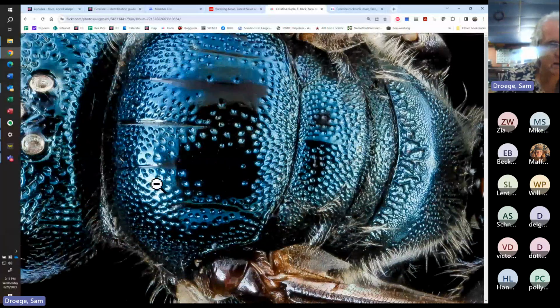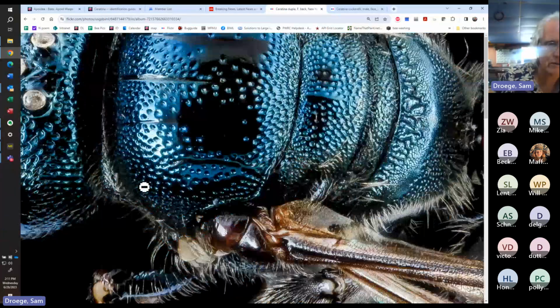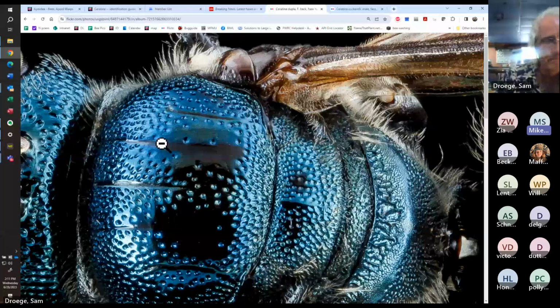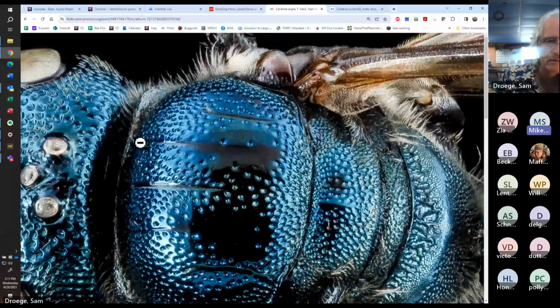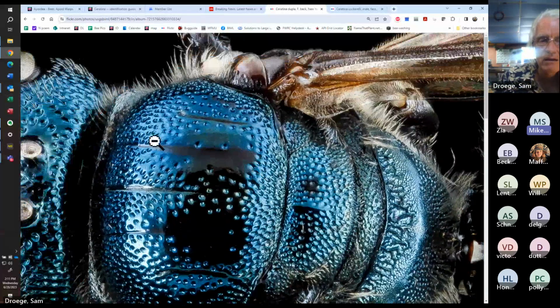So it would be fun and illuminating for everyone to now look at your specimens and see if these lines are present elsewhere. Well, I've got a dupla specimen under the scope right now, and those lines go way back, down into this area, all the way to the end, or at least the rear of the parapsidal line. They're quite long and obvious.